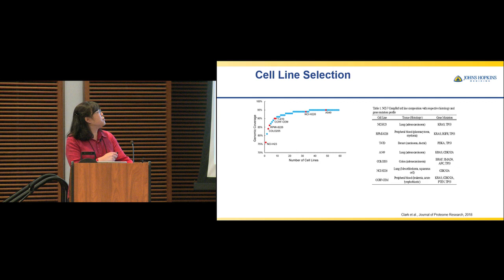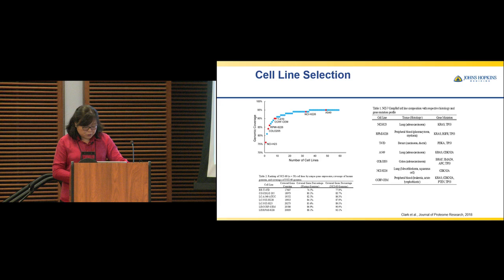Before I go into the glycoproteomics work, I want to briefly describe the reference material we developed here. For the NCI-7 cells, which we published recently, we chose a 7 cell line mixture. The reason is that from genomic data, each individual cell line covers somewhere around 70 to 80% of the gene expression of the entire NCI-60 genome, but the mixture of 7 cell lines covers 92% of the entire NCI-60 cell genome, and roughly 88% of the entire human genome.